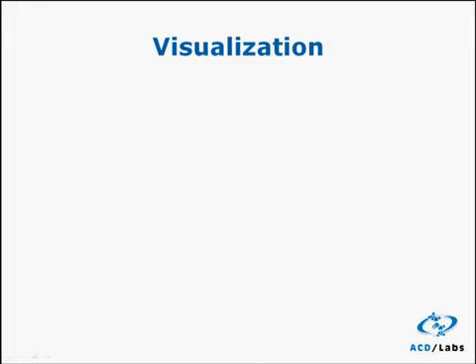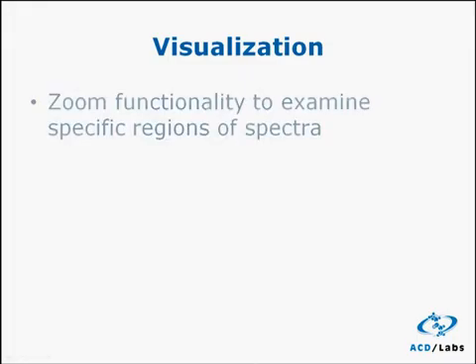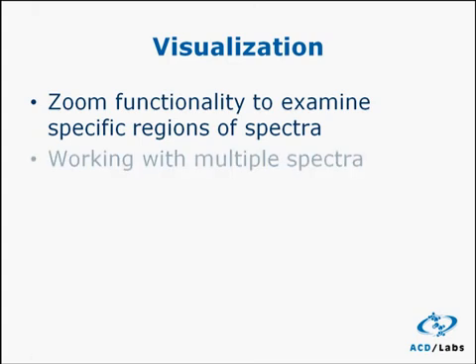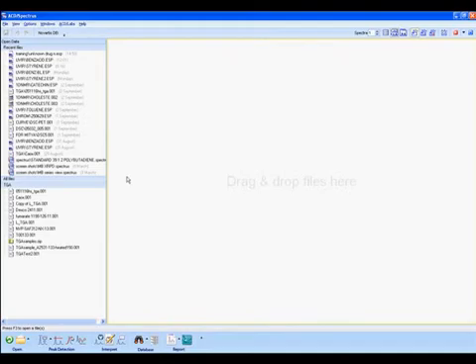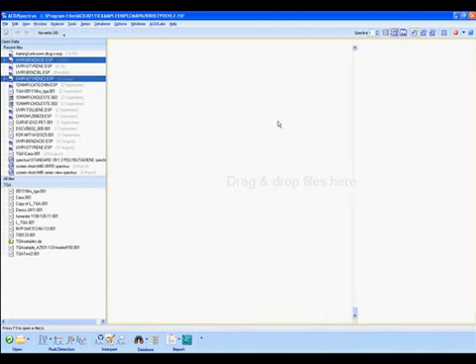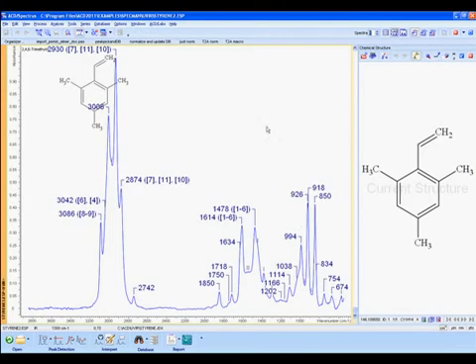We'll now take a look at some of the basic visualization options, including zooming and how to deal with multiple spectra. We'll start with an empty workspace. Using Shift or Ctrl-click, one can select and open multiple spectra at the same time, again, simply by dragging and dropping.